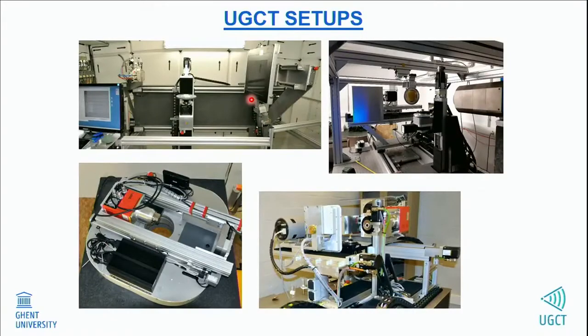Of course, they still emit ionizing radiation, so it's not allowed for us to walk inside. They're also not standard walls for that room. Those are big concrete blocks that we recovered from the old activities on our campus, where there was a 15 MeV electron LINAC. So it was enough to shield that one, so it's enough to shield an X-ray source as well.